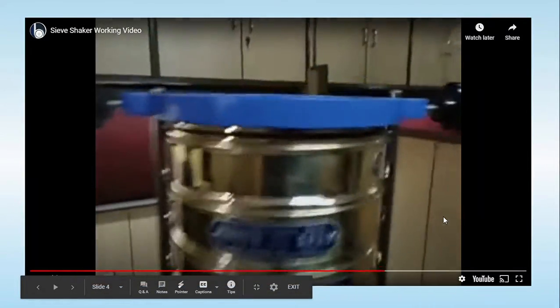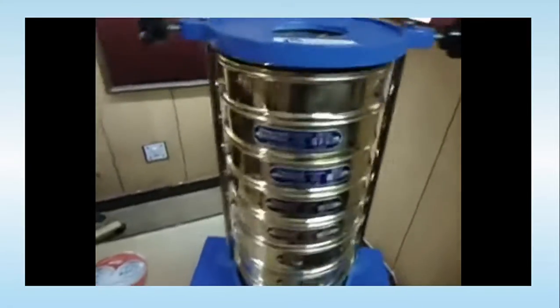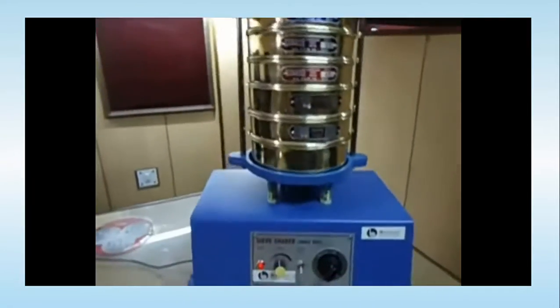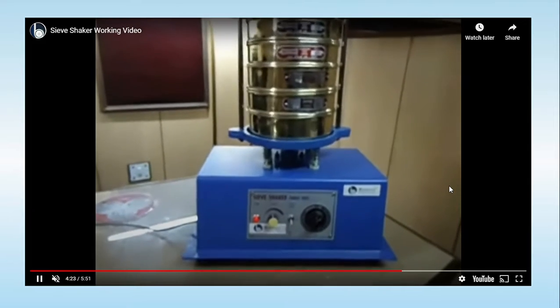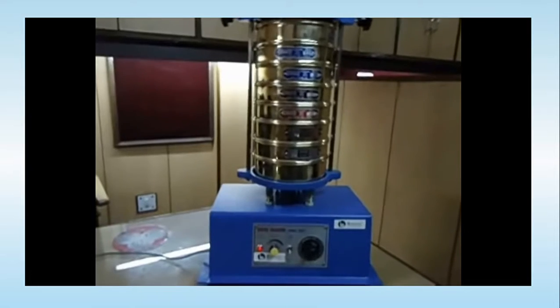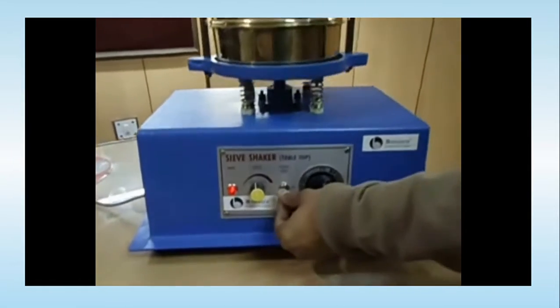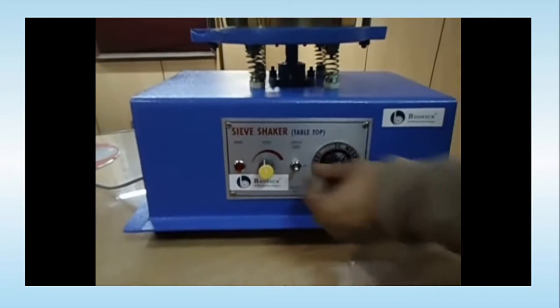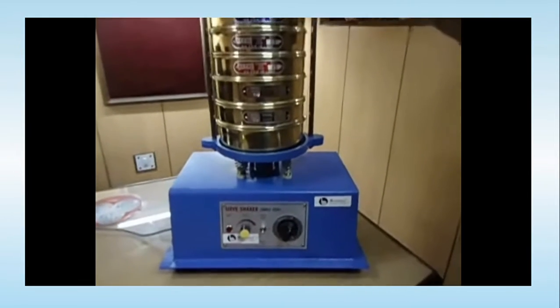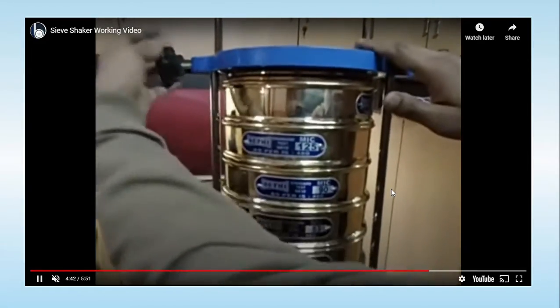After a certain time period, the mechanical shaker is stopped, and we carefully disassemble the entire set of sieves, slowly taking out each sieve, starting from the top, very carefully so there is no loss of powder.